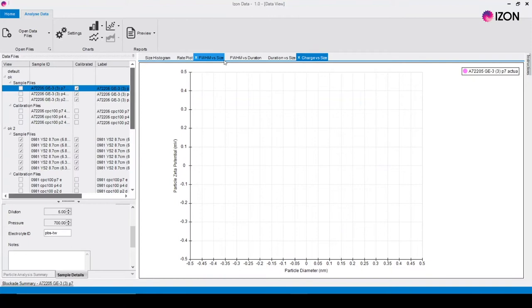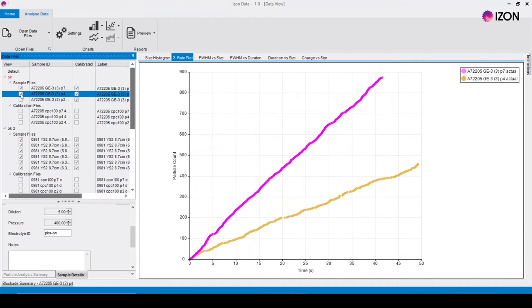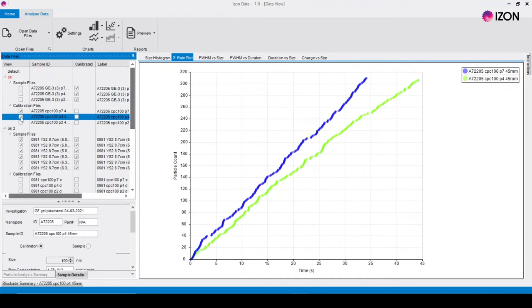The first thing to check when processing data is that the particle rates make sense for your calibration and sample measurements. The particle rate should increase from pressure one to pressure three.